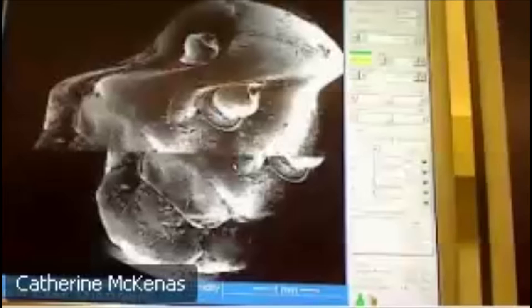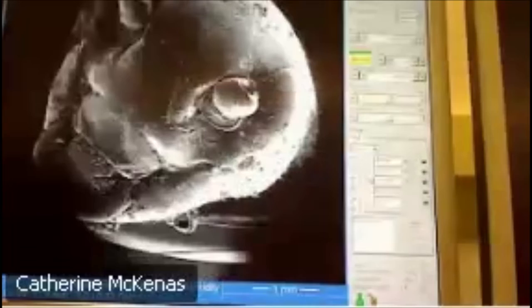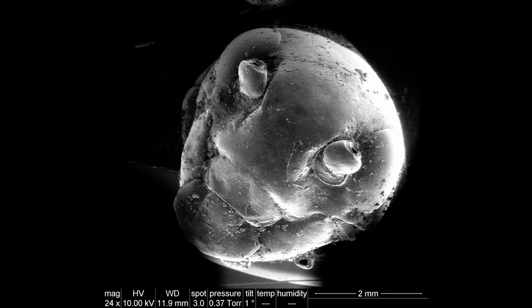So we're going to move over to where we have the cricket head, and this is a really cool sample. We're excited for y'all to see this. Nicole is just, again, moving the stage over to the cricket head, and once she gets there... Oh, here we go. So I did decapitate the cricket. I said very nice wishes for him after I did it. We're going to take a picture first of this view. I chopped off the head and put it face up, so we're looking right down onto the cricket's head, kind of like a bird's eye view. And he's smiling. You can see him smiling at y'all.